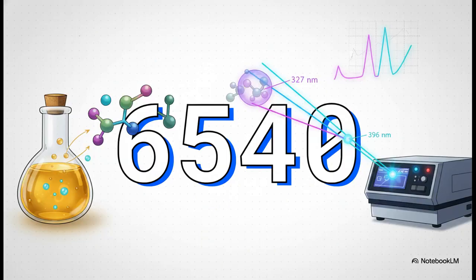So the really crucial point here is this specific number, 6540. This is the molar absorptivity coefficient of our newly formed complex, measured in liters per mole per centimeter. To put that into perspective, once our MSE binds to the nickel, it generates a massive, vibrant, and easily measurable absorbance signal.